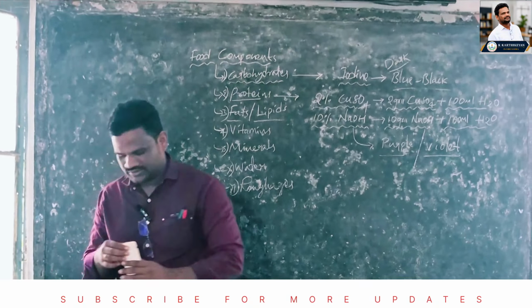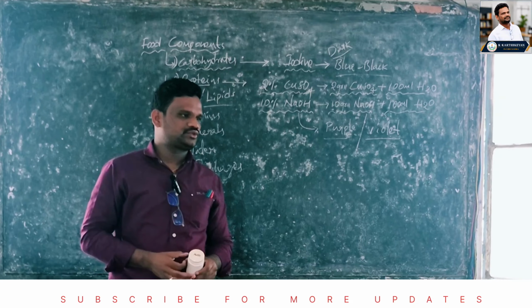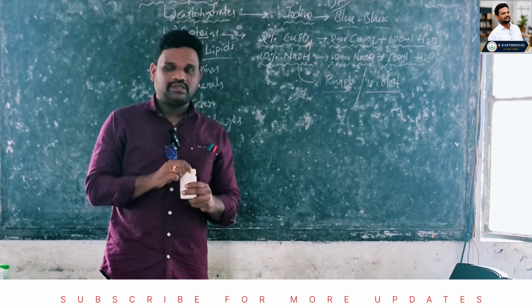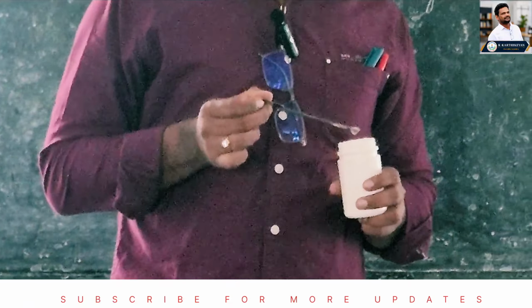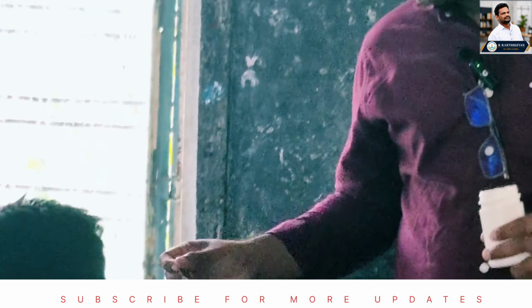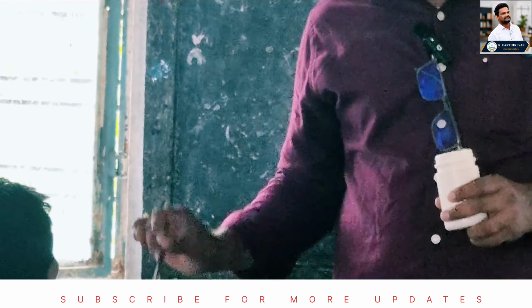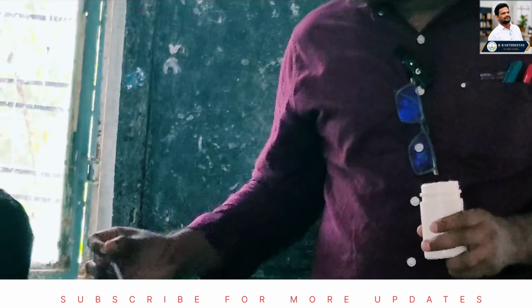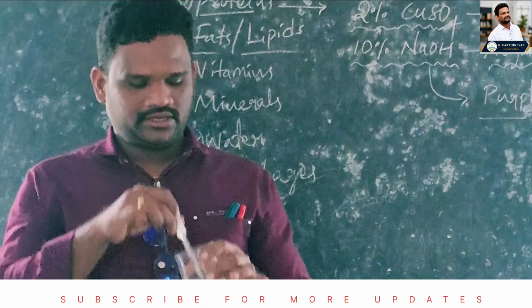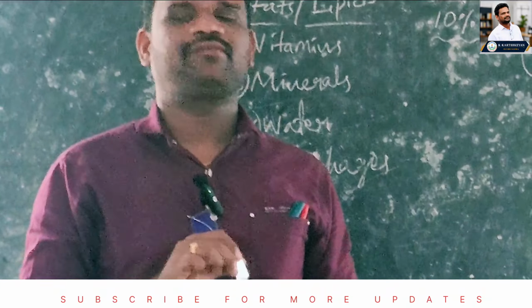Now this is NaOH, sodium hydroxide. We need 10 grams. We have to imagine that 1 spatula is equal to 1 gram. 1 gram, 2 grams, 3 grams, 4 grams, 5 grams, 6 grams, 7 grams, 8 grams, 9 grams, 10 grams. Now stir it well.